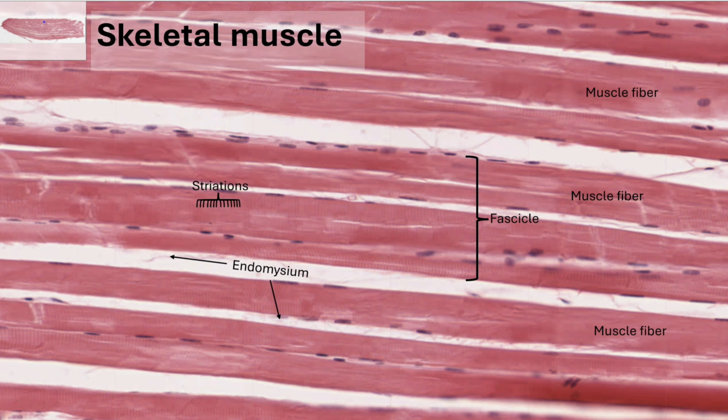Note that the entire cytoplasm of the muscle fiber is taken up with sarcomeres. The remaining organelles, therefore, are pushed to the margins of the muscle fiber. Muscle nuclei are easily visible on the margins of many muscle fibers.